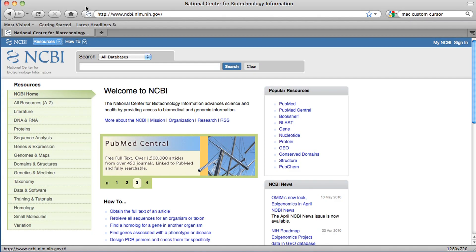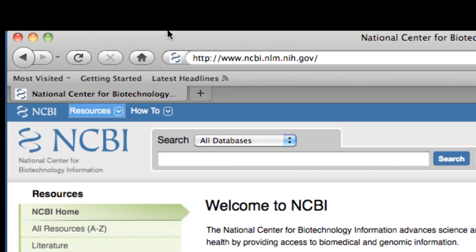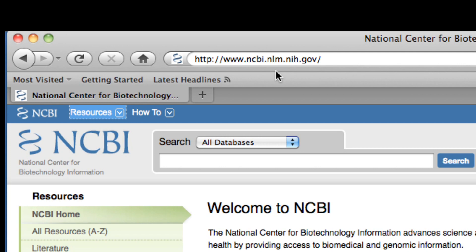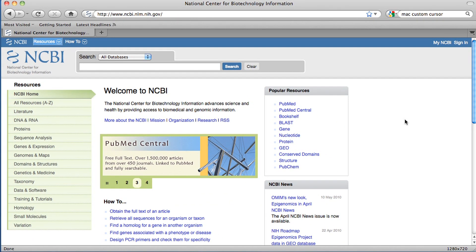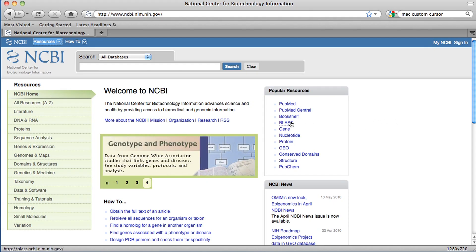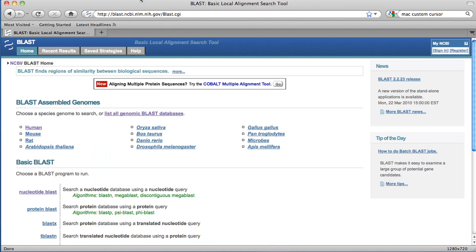Our starting point is the NCBI webpage, which is www.ncbi.nlm.nih.gov — one of the more used websites in bioinformatics. I'm going to click on the right menu; the link says BLAST. Or I can also just go to that web address and after the slash, just type in BLAST. That'll get you there as well.